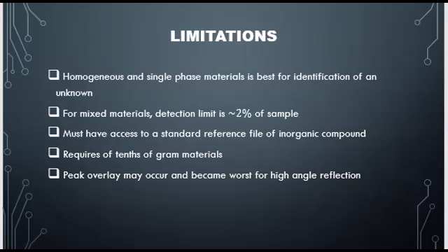Other limitations for this process is that there is a sizable amount of material needed in order to run the test. So if you don't have very much of your sample, it will be a challenge or impossible to run XRD.